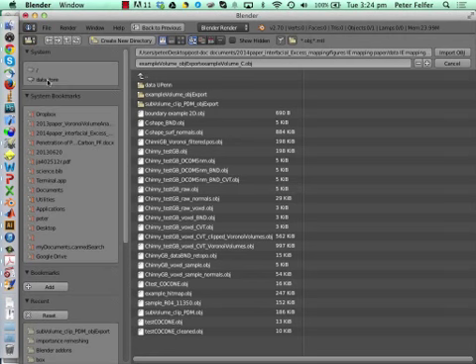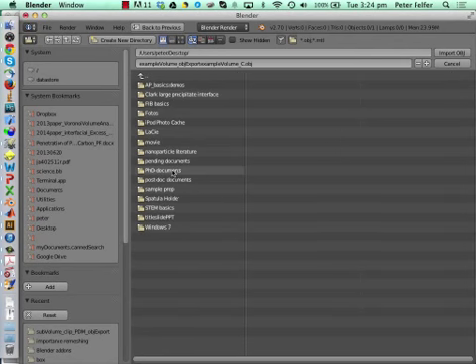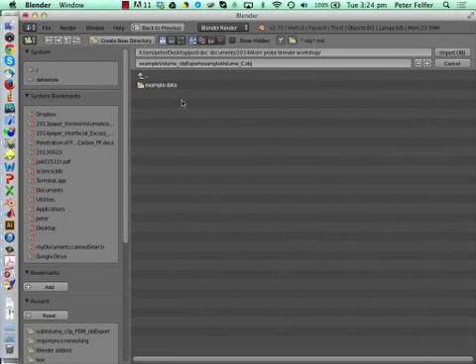Anyway, so now we'll just need to find, where did I put this? It's documents. I think who else has got the data? Where did I put that? I think it might be on the desktop. Postdoc documents. There's supposed to be 2014 Atom Probe Blender Workshop, example data.